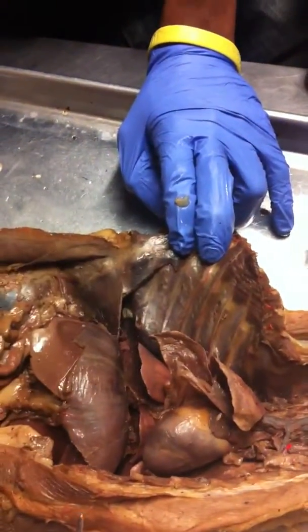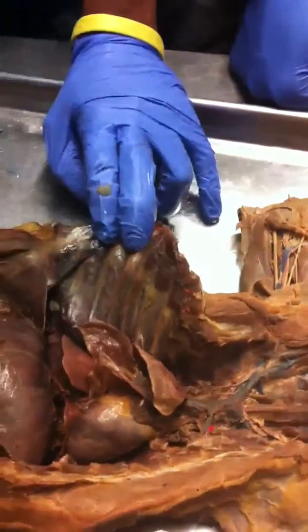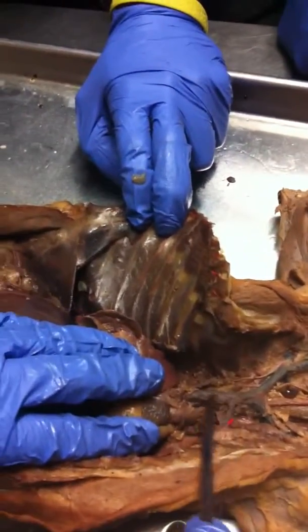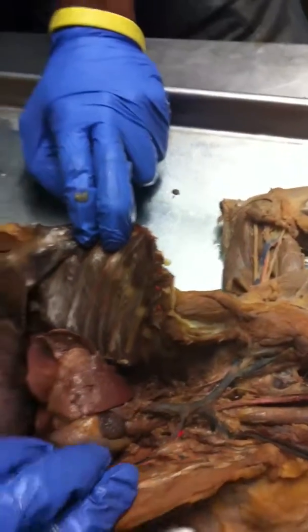Common carotid artery. You sure? I thought that was this. We already showed that, right? Damn, I'm tripping. Brachiocephalic vein. We didn't show that yet, right? Here is the superior vena cava, and the 2 branches off would be the brachiocephalic veins.